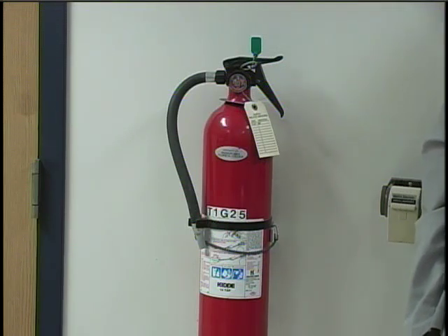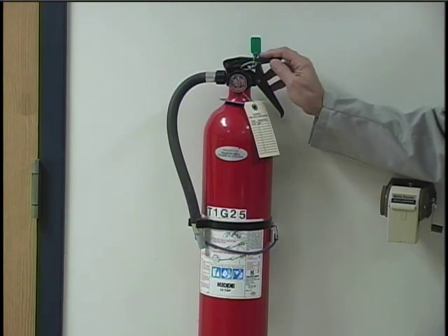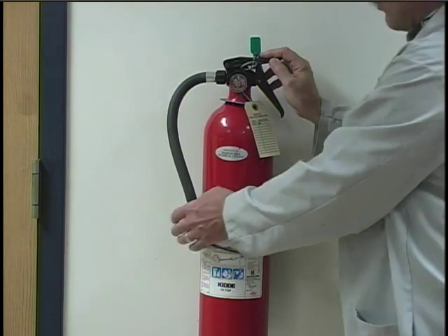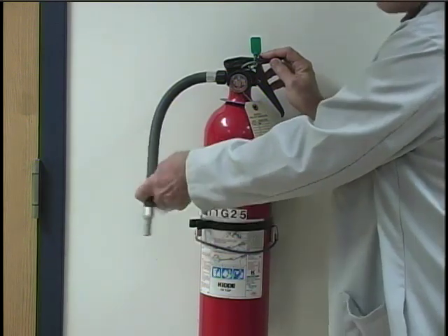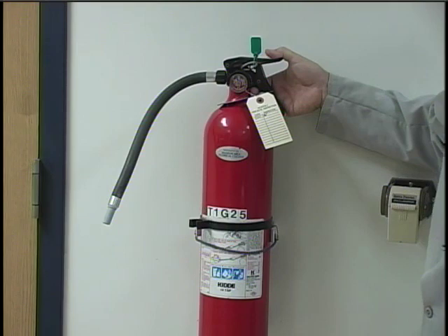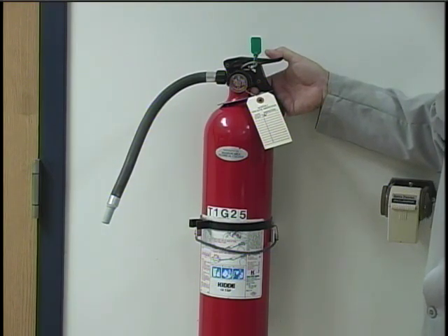If we had a fire that involved equipment and not a burning person, we would most likely use the fire extinguisher. Most of our labs have only one fire extinguisher in the room, so you should note where it is in your particular lab. To use the extinguisher, pull it off of the bracket on the wall, pull the safety pin so that the handle becomes functional, aim the nozzle at the base of the flame, and squeeze the handle, which will release a dry powder that will extinguish most fires. The extinguisher should be used for chemical fires and not for burning people.